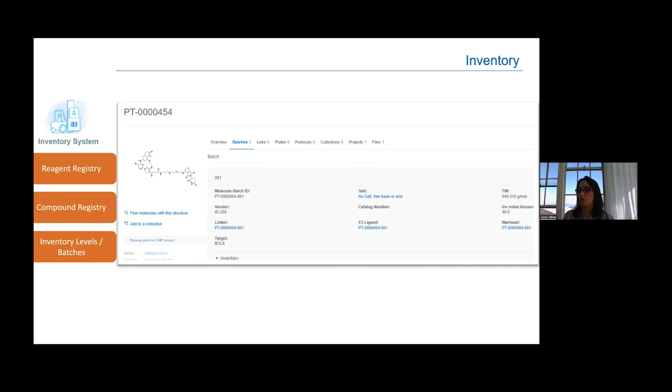The second module we call inventory. Inventory allows you to track and keep track of your reagents and compounds and automatically updates your inventory levels. Right now, this inventory model is going through really big, serious enhancements on our side. So soon it's going to be very fancy for all the users.